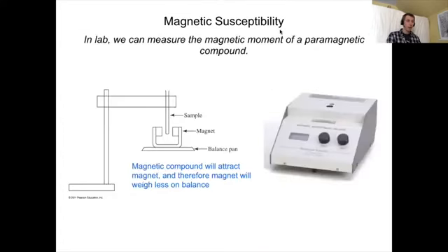So first, a little bit about our magnetic susceptibility balance. This is the balance that you used in lab. It's sometimes called a Johnson-Matthey balance. A simple schematic of the device can be shown here. This is what it looks like inside this box. And basically what we have is a support system, and then we have a bar going across and a spot to insert our tube. So here's your sample tube that we all used in lab.